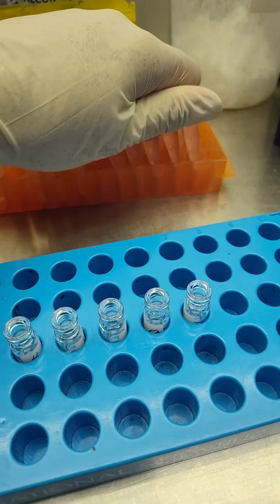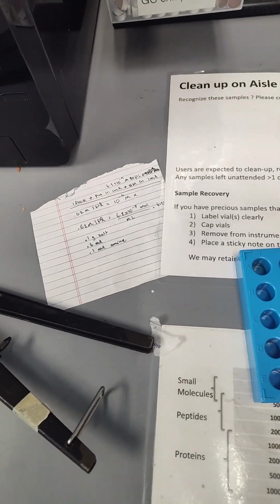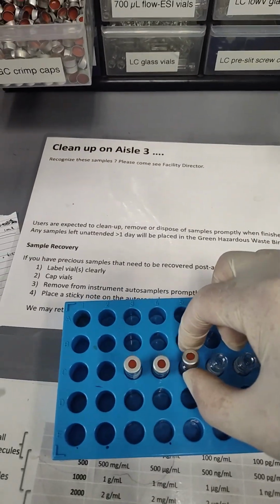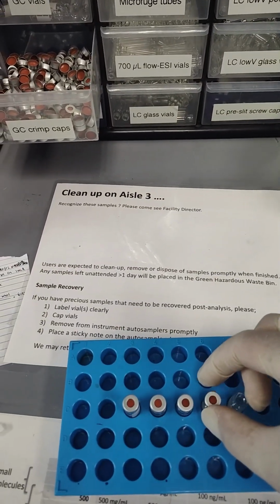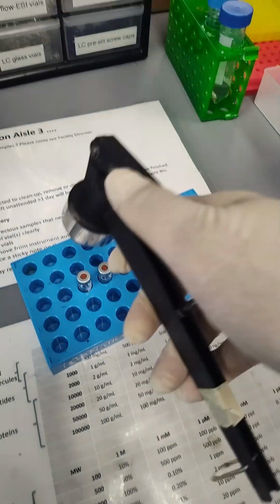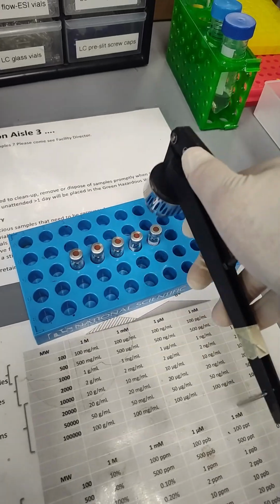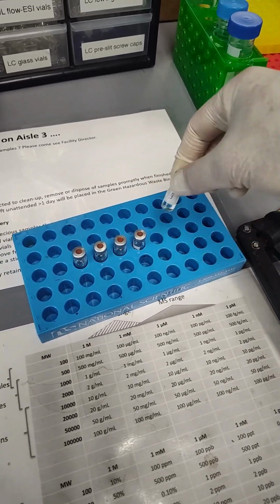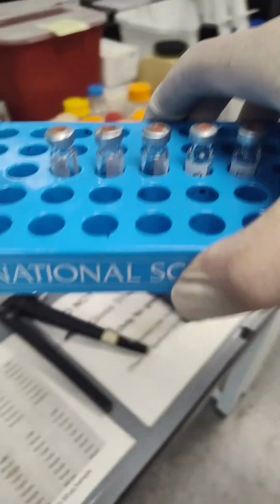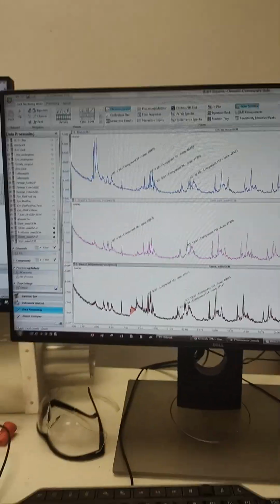Alright, so pulled 200 microliters of the bottom layer of each, put them into 800 microliters of clean DCM. We're going to go crimp cap these tubes. Alright, crimper. Alright, you can see, all crimped, labeled, ready to go to the instrument. A little swirl. There we go. The DCM extracts onto GC and we've run them.